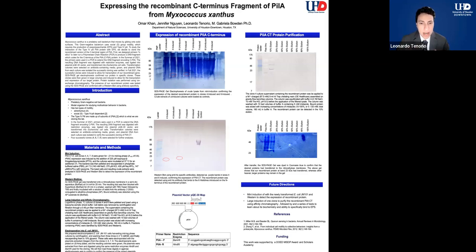Furthermore, the cells were electroporated using the plasmids extracted from cultures with the clones 4, 6, 7, and 8. The electroporants were plated in LB medium that contained ampicillin. And lastly, the plasmids were extracted and digested using HindIII and BamHI restriction enzymes, as you may see in the bottom left figure. The digested plasmid will be loaded in agarose electrophoresis gels to confirm the presence of such plasmids.